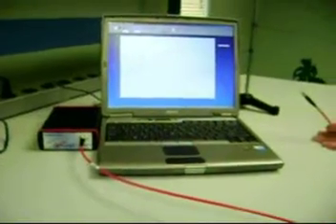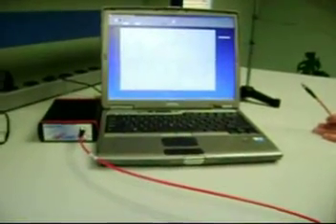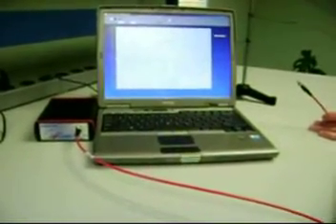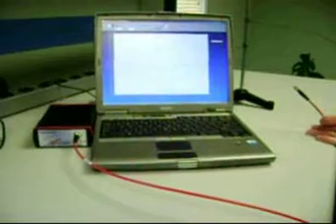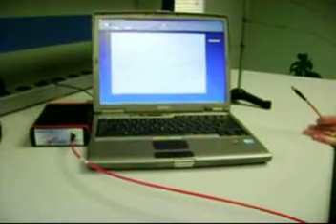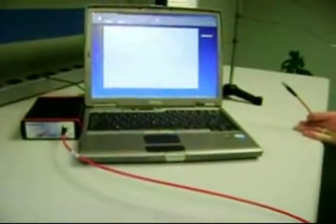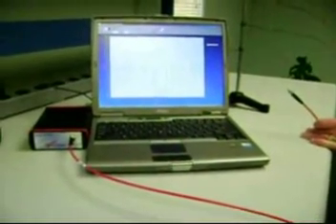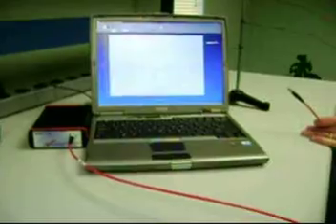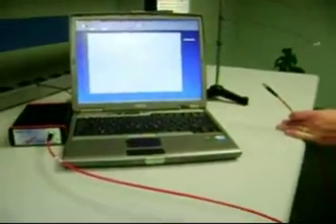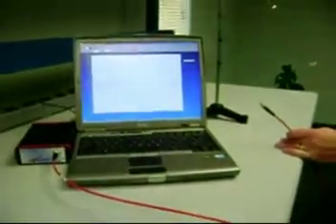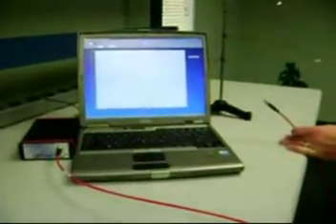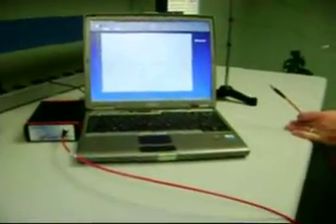The equipment required to complete this type of measurement is an Avispec spectrometer with a small slit, preferably 10, 25, or 50 microns in order to resolve emission lines, and a fiber optic cable and a computer configured with Avisoft software.